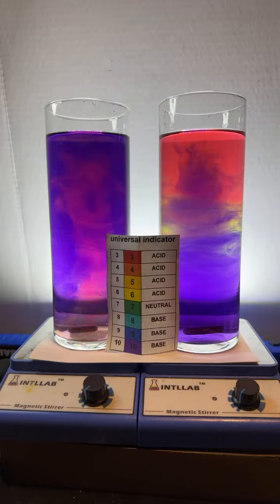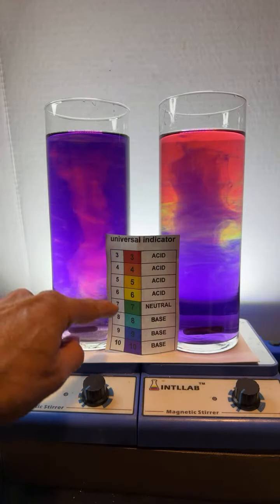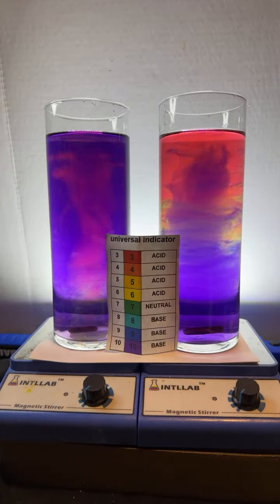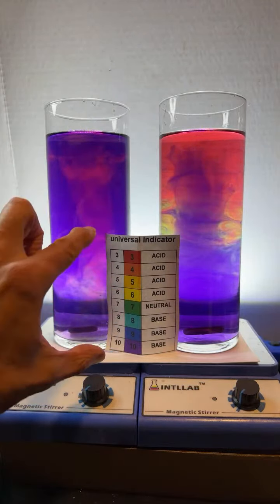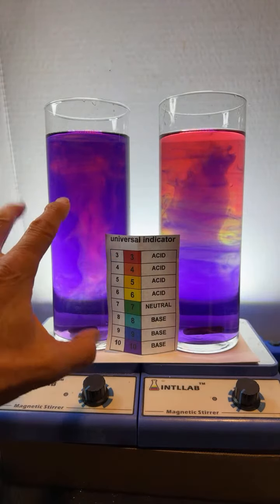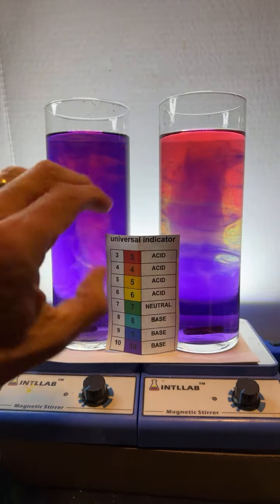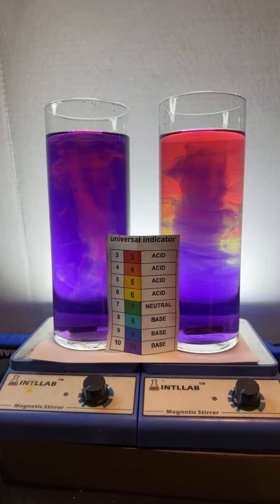Millie, what this is, is water to which I've added a special mixture of chemicals that are called universal indicator. We use it just to test pH. The different colors that you see are telling you how acidic or basic each region is. The more red it gets, the more acidic it is. The more violet it gets, the more basic it is. And if you see green in that region, it's neutral.